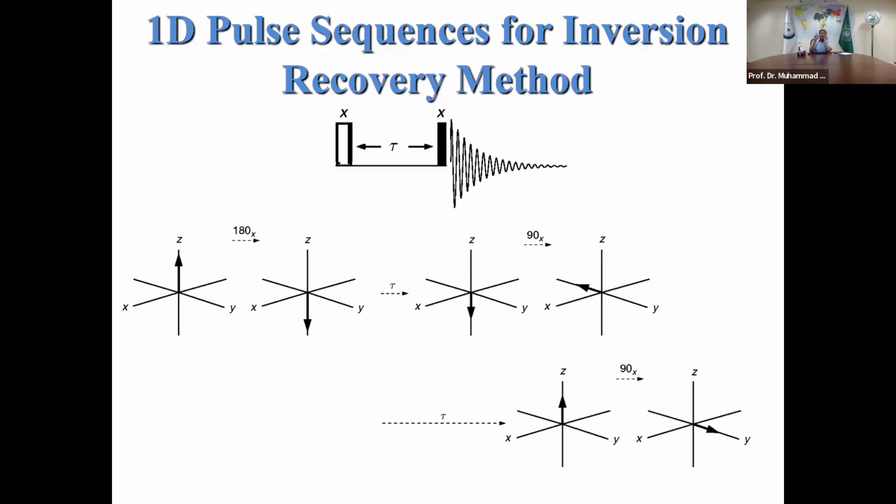And during this time, you should now understand why it is important that NMR is multi-pulse. And second, that now you can see the position of these vectors on XY plane. And with time, they're inverting back to the positive point.